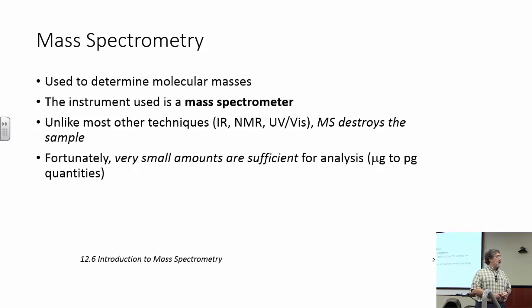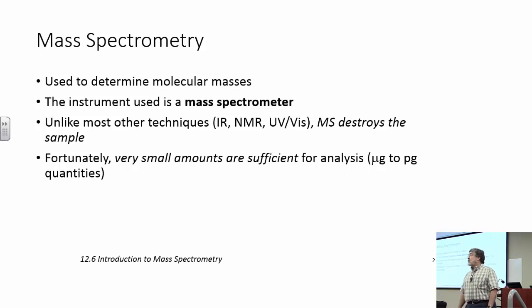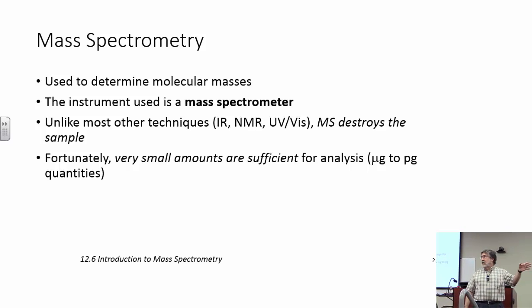Okay? It's different. And how it's different is the instrument essentially breaks a molecule into its pieces and weighs the parts, and then reports to you what the parts weigh. That's pretty cool, right? But that's not shining a beam of light at it of some frequency and seeing what's absorbed and what's not absorbed. Okay? So it's a very different technique.